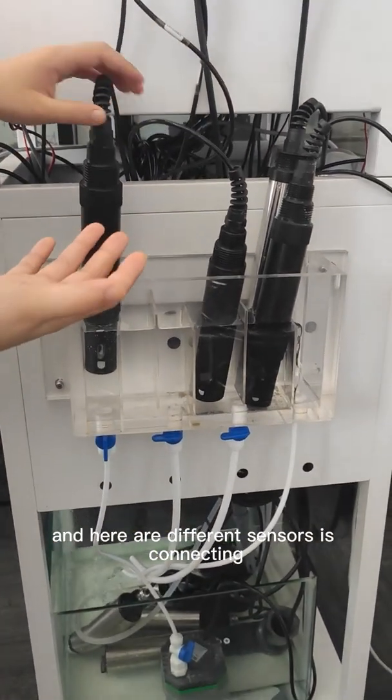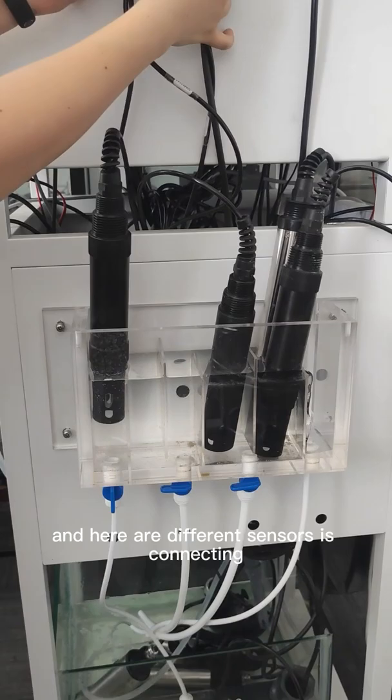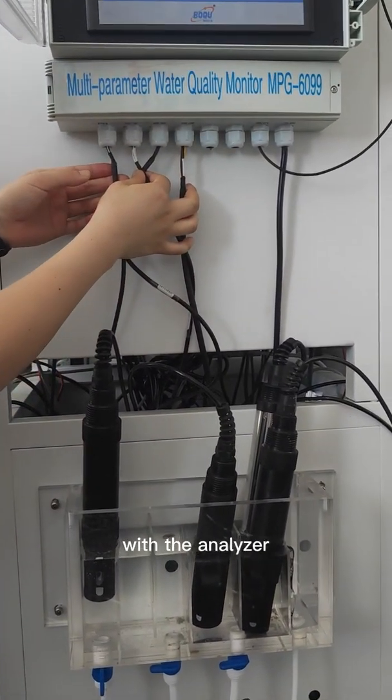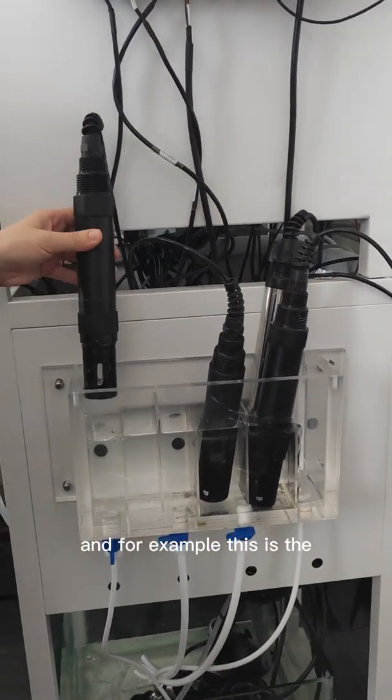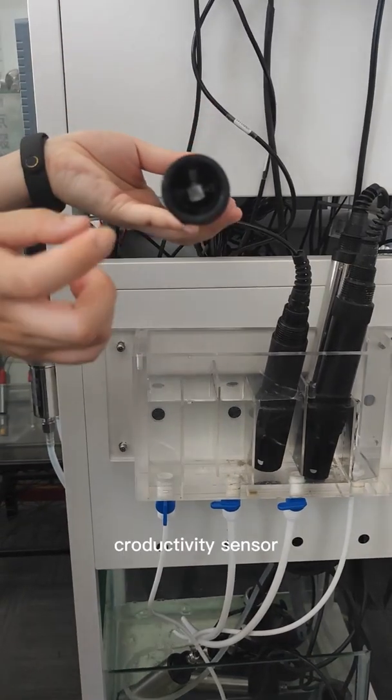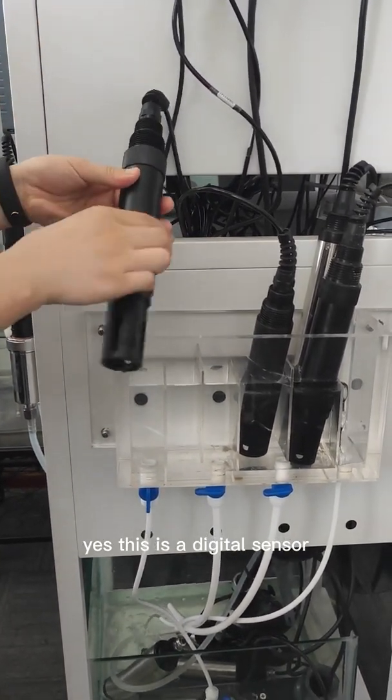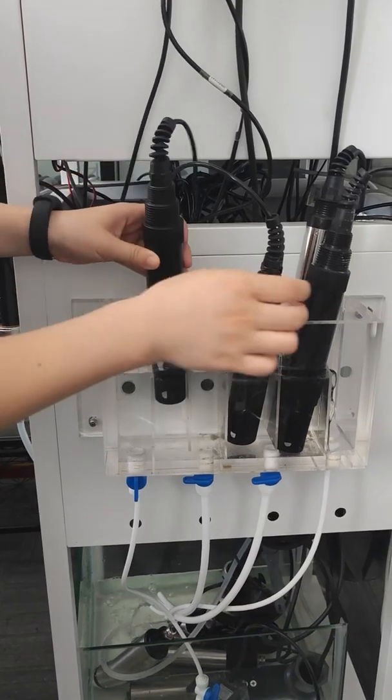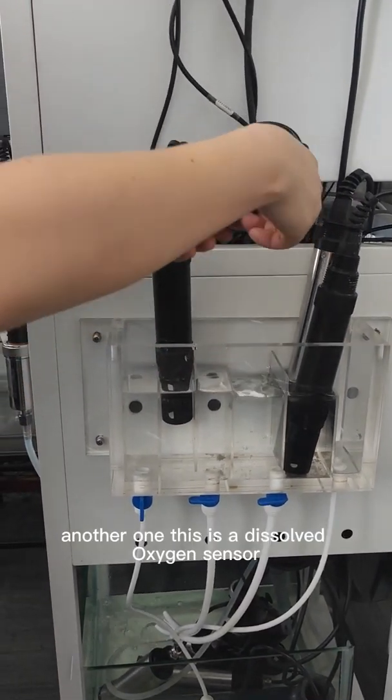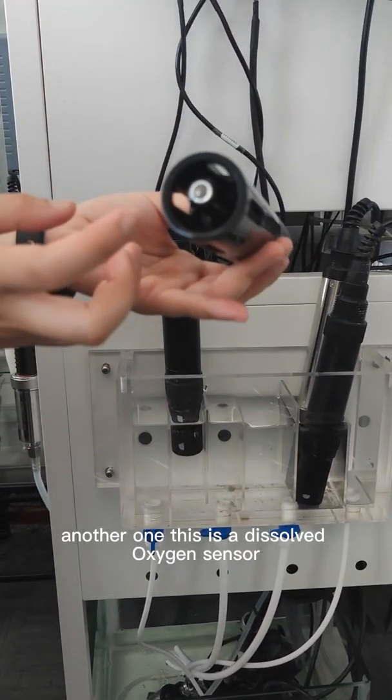Here are different sensors connected with the analyzer. For example, this is the conductivity sensor. Yes, this is a digital sensor. And another one, this is a dissolved oxygen sensor.